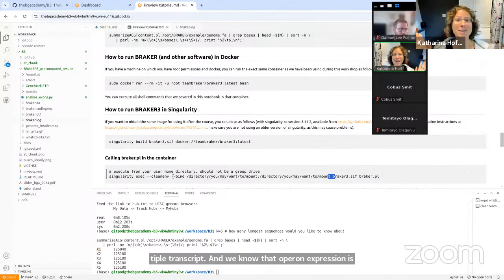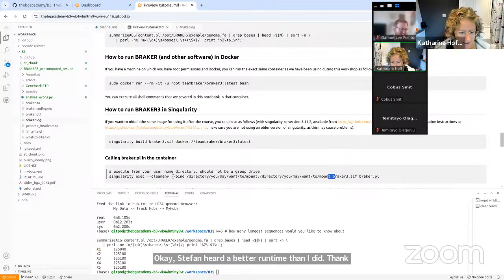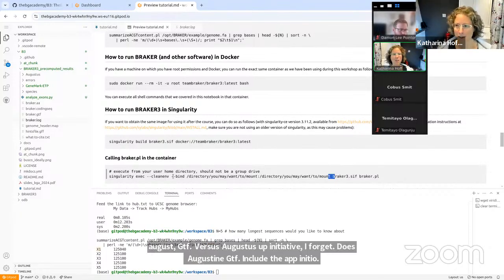Okay, Stefan had a better runtime than I did. Thank you for reporting that. Sam says, Augustus Hints GTF versus Augustus ab initio GTF. I forget, does Augustus Hints GTF include the ab initio? No, it does not. Something we did not cover today.